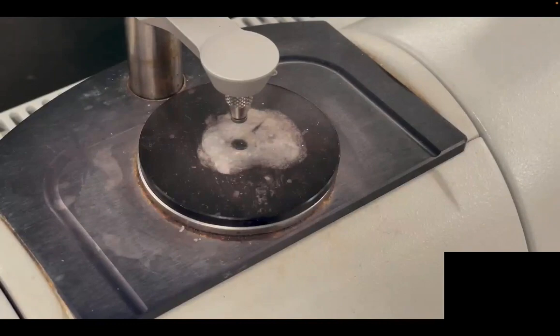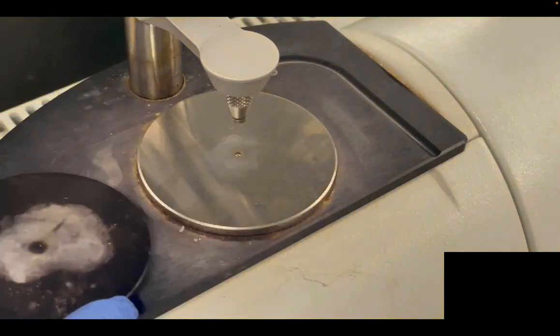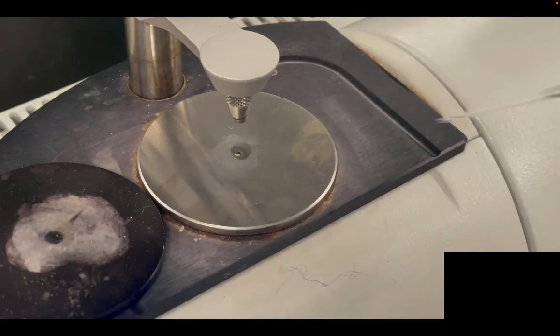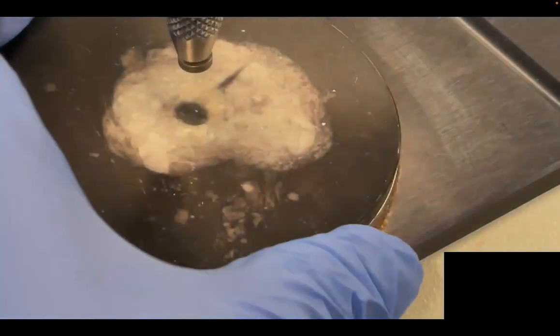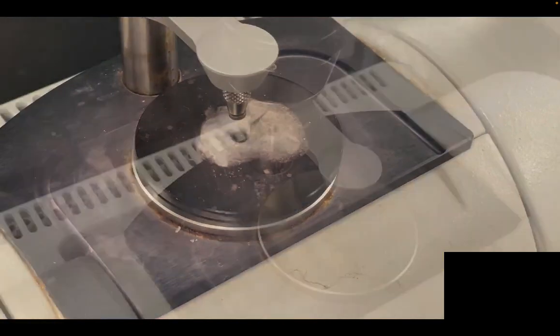First thing you want to do is remove the black cover on the sample holding area. And you want to load your sample onto the crystal in the middle. If you have an oily or liquid sample, pipette just a little bit until it fills the ATR crystal, and then cover with the black cover.